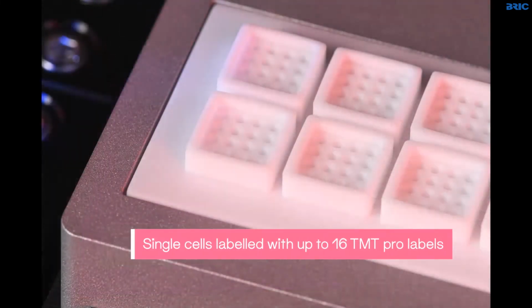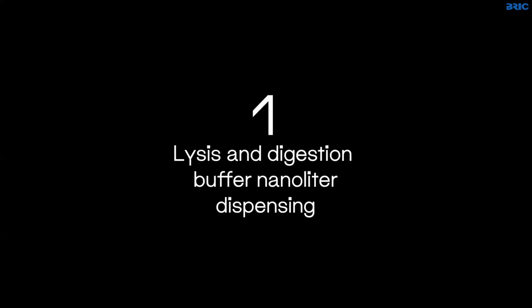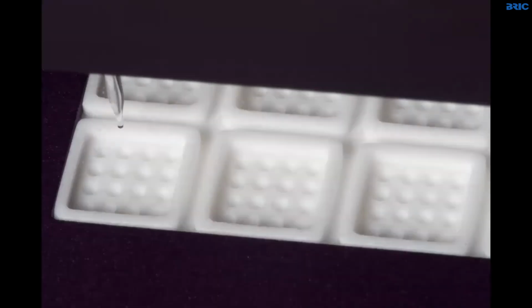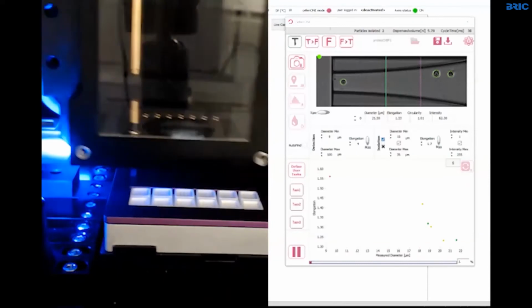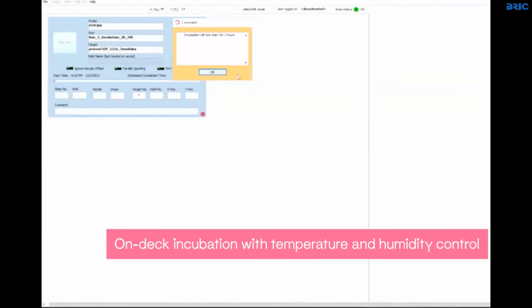Each of those contains an array of 16 wells. So there are 12 arrays on each chip of 16 wells. First, we add the lysis and digestion buffer in each of the wells using the CellenONE. Then we undertake single cell isolation in each of those wells that has been pre-filled with a reaction mix. We then undertake the incubation on the deck.